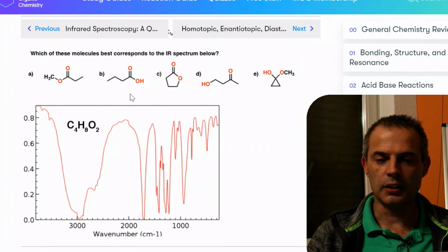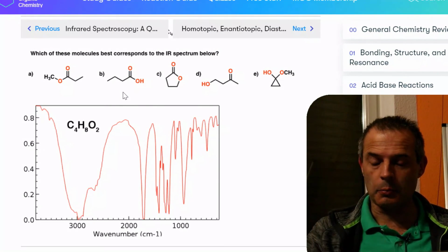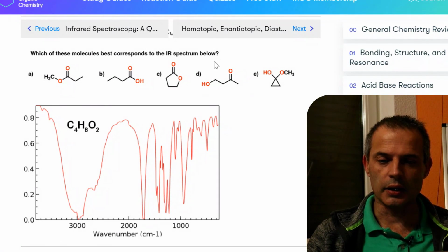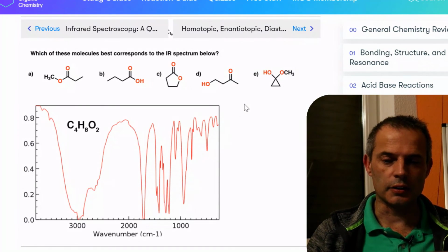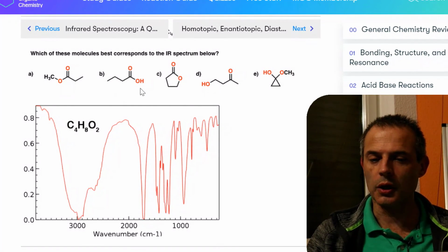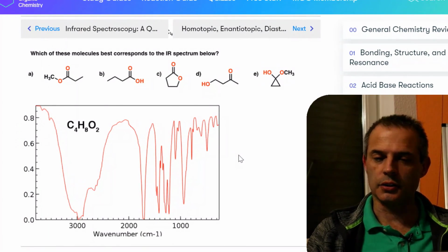We can identify it fairly easily. It's not a very difficult molecule to identify otherwise because it's very smelly, but the only one that would cause us real trouble here is D, because we might get confused by that one. All of the others are easy to knock out. This one here with its little ring, what I did check was whether there's any unsaturation there, whether there's too few hydrogens in there from the chemical formula, which they expect you to do. It's just their style of question.